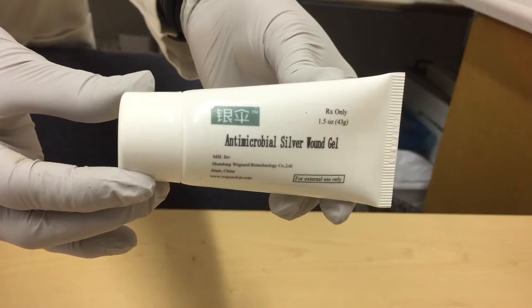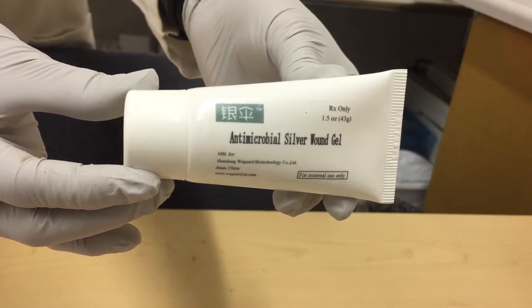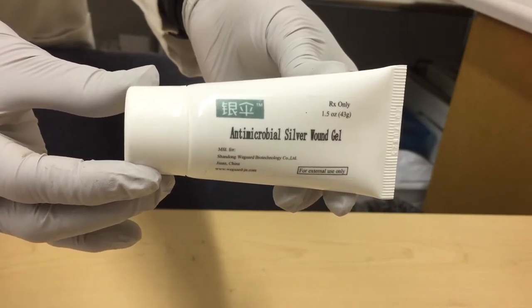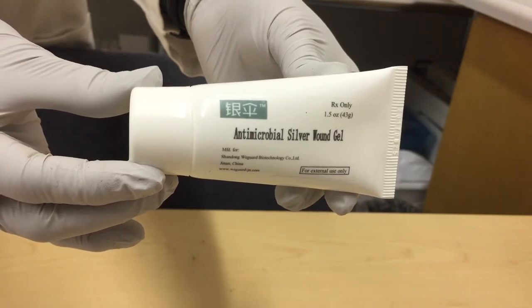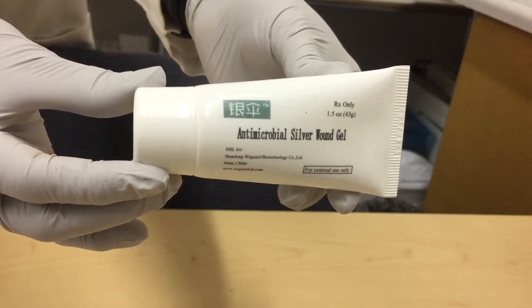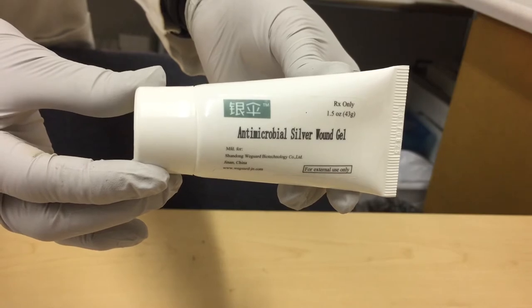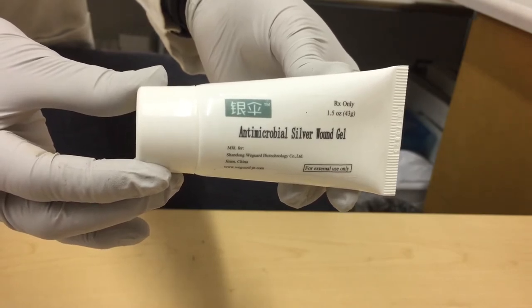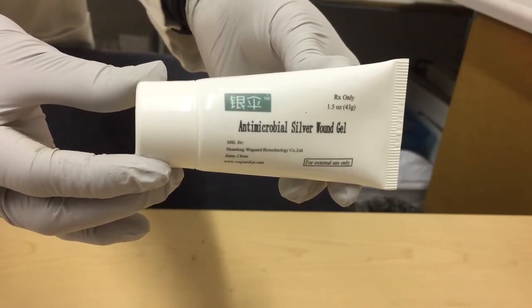The gel is a patented and FDA approved formula that contains 550 parts per million silver. Today we will demonstrate the unique chemical ability of the gel to withstand a steam sterilization cycle at 250 degrees Fahrenheit for 15 minutes.